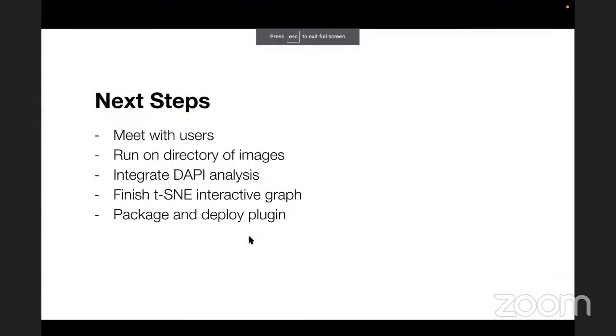So the next steps that we have are to meet with our users. So this is being created for people who don't necessarily have all of that coding experience. And because they are familiar with ImageJ, it would be a lot easier to integrate into the workflow of a biology lab. And so that's the point of creating this plugin. And so we're hoping to meet with those users and identify areas where we can improve this plugin, make it easier for them to use, and maybe add on some features that they would want to incorporate.